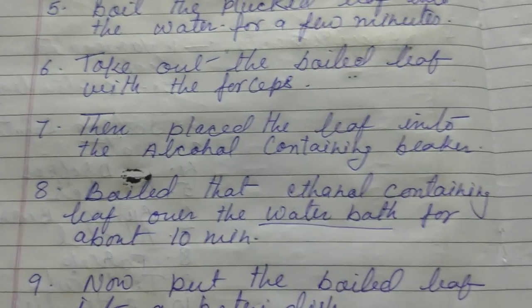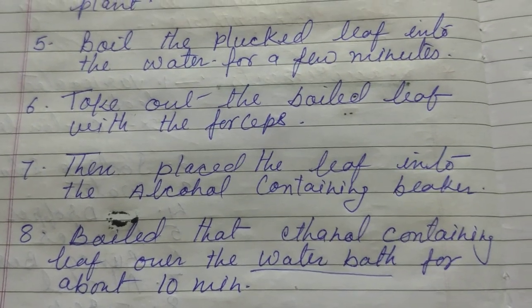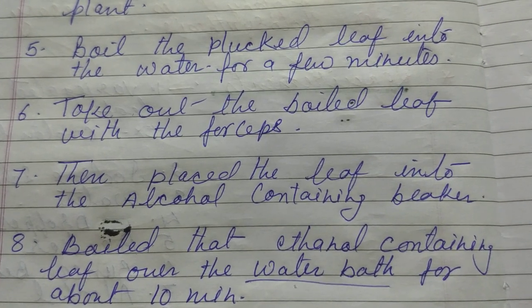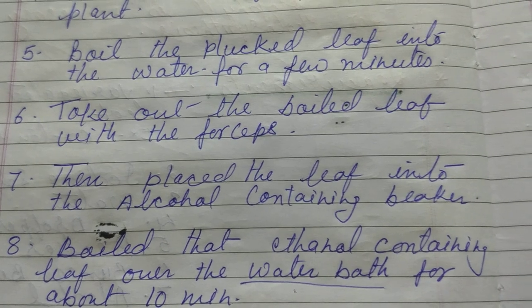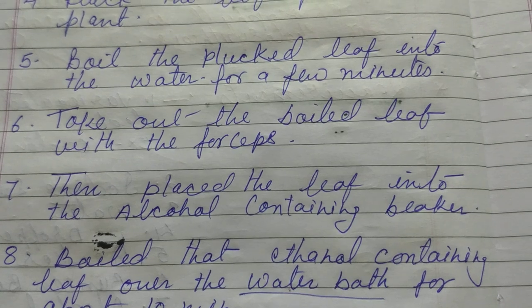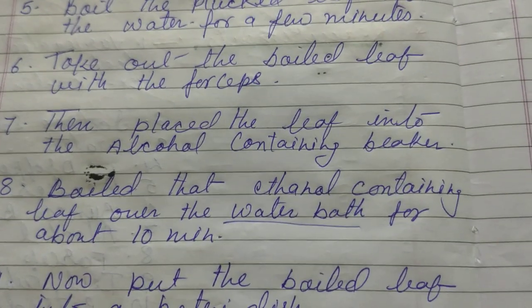Then place the leaf into an alcohol-containing beaker. We have to take a beaker or a test tube and pour 70% alcohol into it. Then we have to place the boiled leaf into that alcohol-containing beaker or test tube.